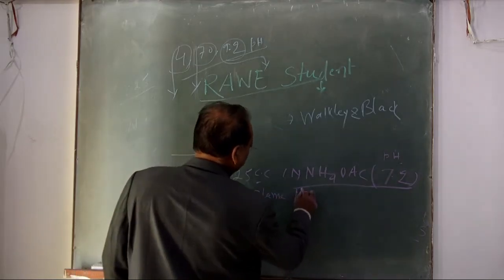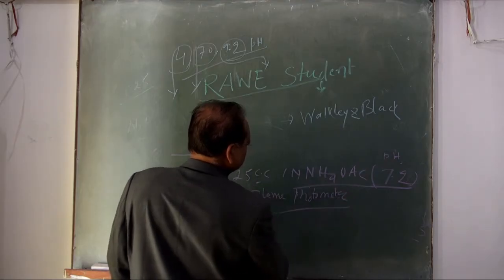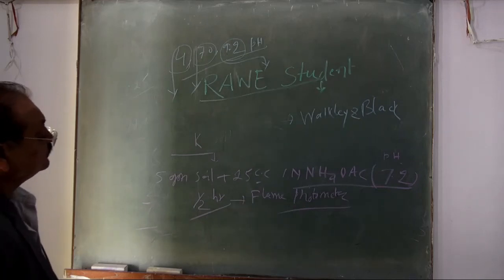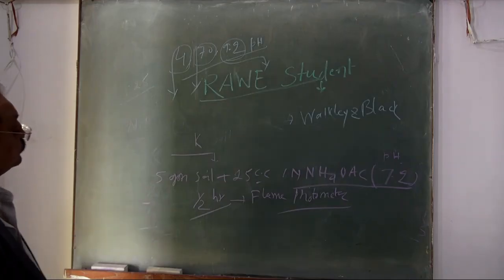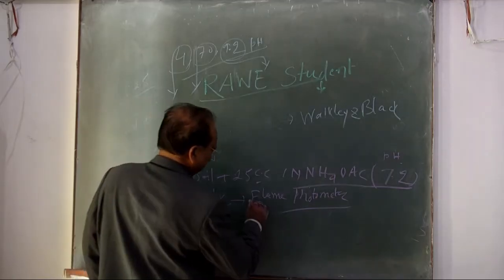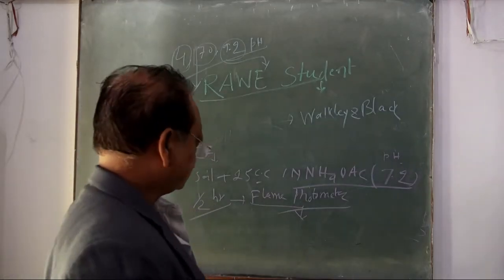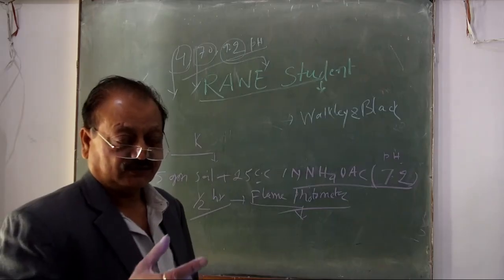Before taking the reading of your soil samples, you have to calibrate this flame photometer with the help of standard solutions. Standard solutions means known strength solutions.